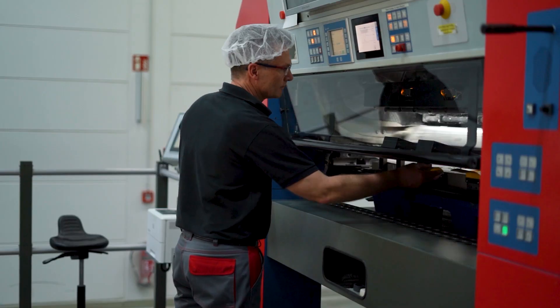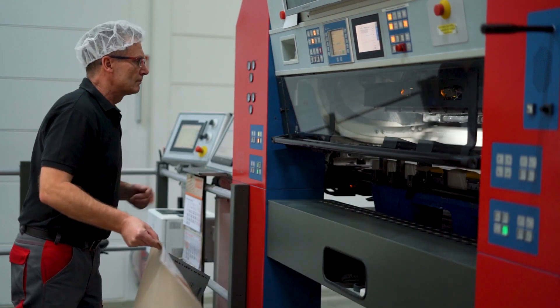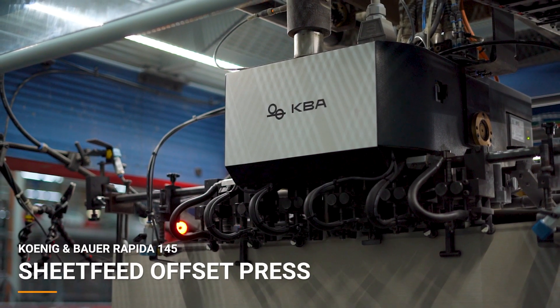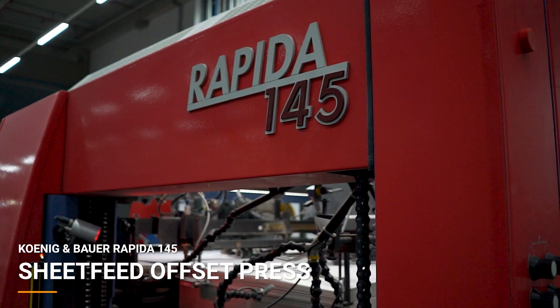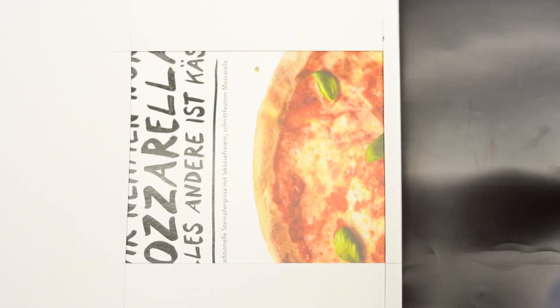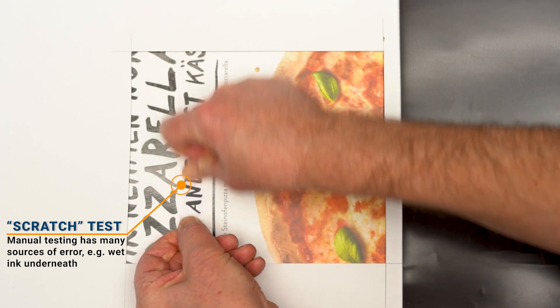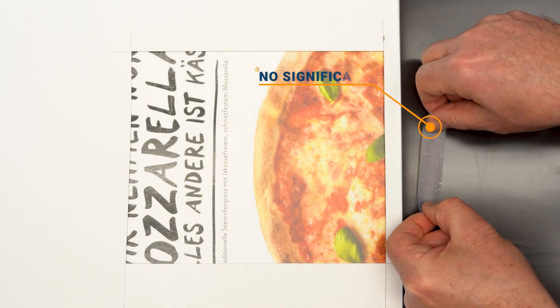This also applies to the quality control of printed food packaging products. The UV coatings used are typically cured with UV radiation while they are still in the press at high speeds. The aim is to achieve full curing and thus a food-safe coating. But how can this be checked? Manual test methods such as determining scratch resistance by fingernail or adhesive strip are not effective and show high variance, or don't work as intended.